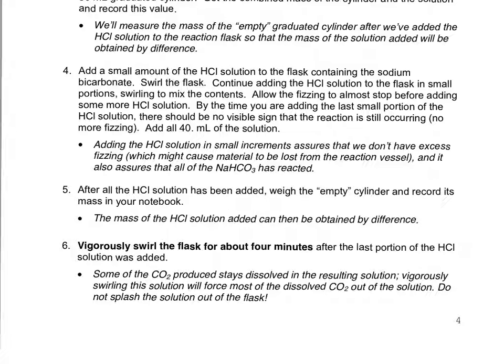And so what we're trying to do is drive off all of that carbon dioxide gas. Everything else is going to stick around. And so here in a minute, we're going to do a mass balance, and you're going to see that the products you end up with are lighter than the reactants you started with. Of course, we know matter was not lost, but it was lost from your beaker. It was released to the room. You just added to global warming, okay? So that's kind of the nuts and bolts of what we're going to do.